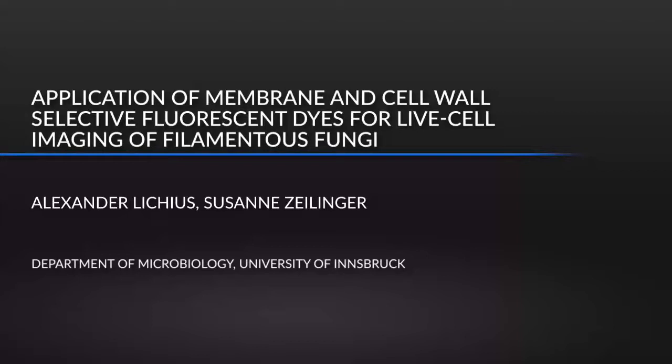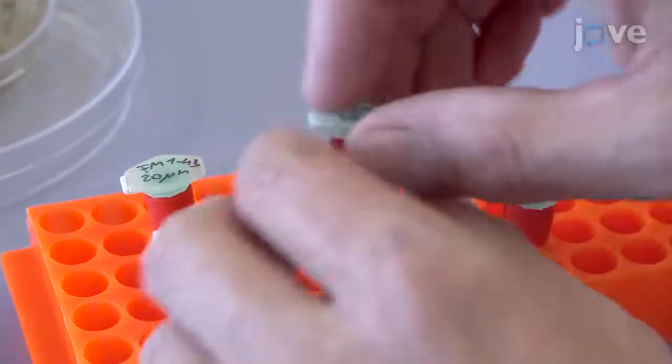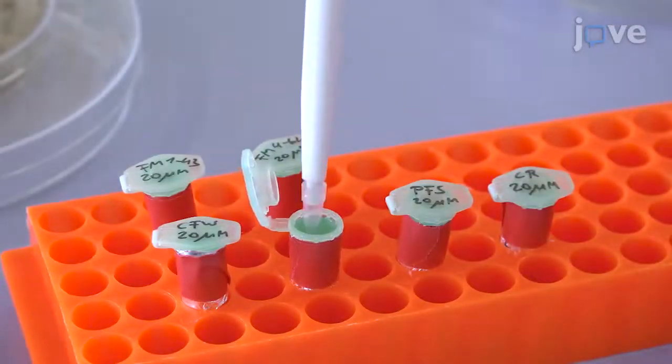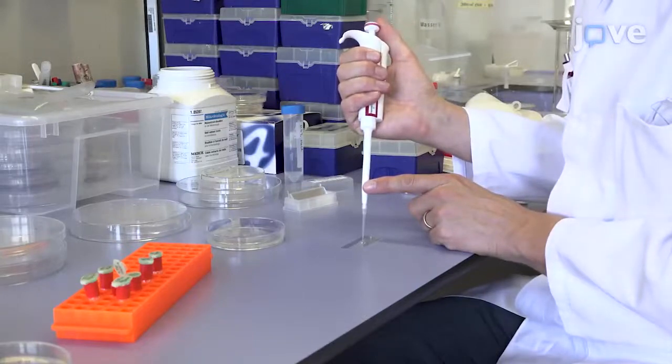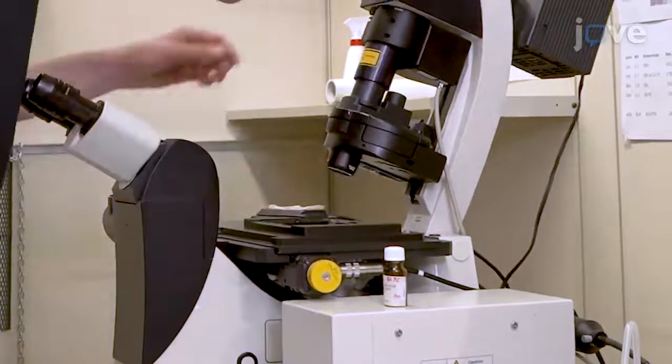Membrane and cell wall selective fluorescent dyes are important tools for the analysis of organelle dynamics in living fungal cells. Our protocols provide essential theoretical background and practical guidelines for the application of a selection of these dyes as truly vital stains. The key point for this is to use very low dye concentrations that do not cause cellular artifacts related to saturation or dye toxicity, while still providing good signal-to-noise ratios for high-quality long-term live cell imaging.